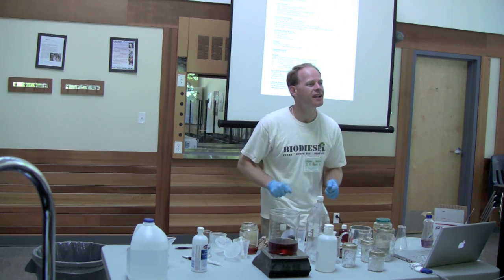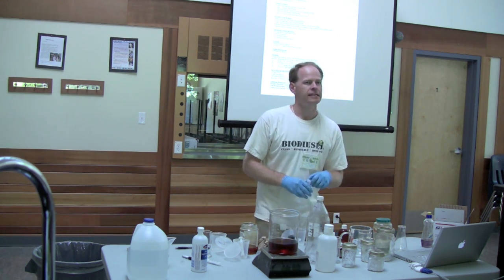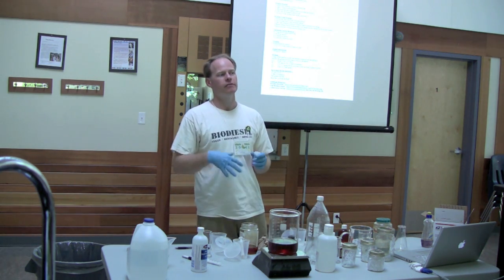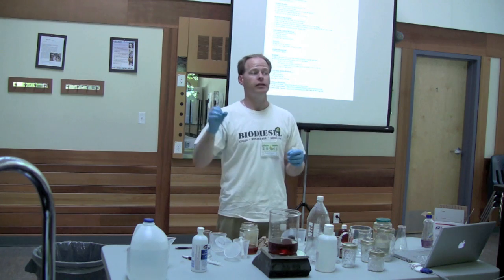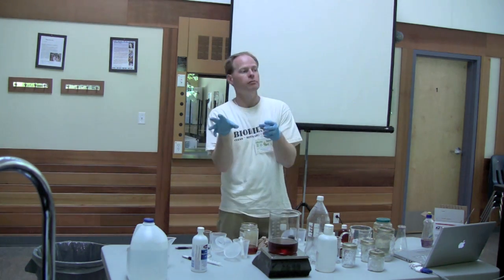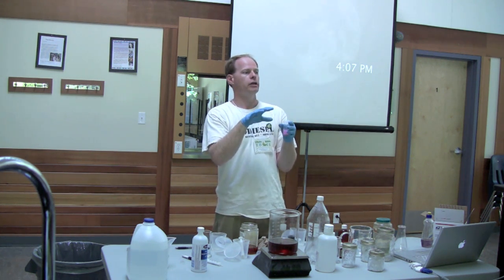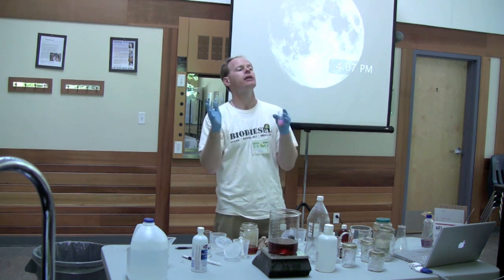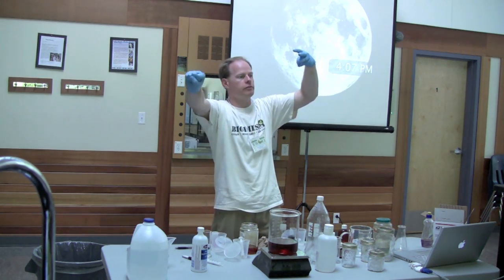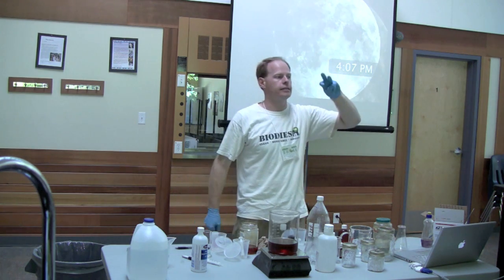If you're just adding an arbitrary extra amount, is that more likely to create soap at the end of the equation? Depends on your oil. If you don't know what that oil's titration was, and the oil was really titrating high, and you always threw the same amount at it, no. You'll always get a little bit of soap if you're neutralizing it, but if it titrated high, you're still not going to get good biodiesel, because a lot of those free fatty acids went after your lye before they ever got around to going after these here.